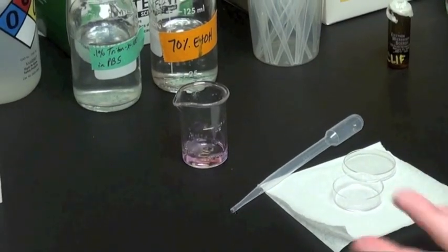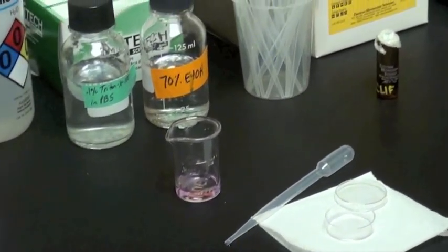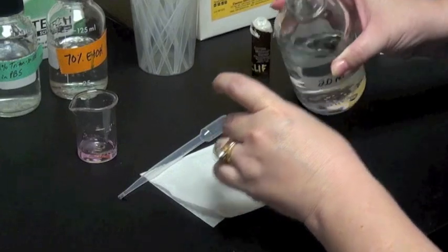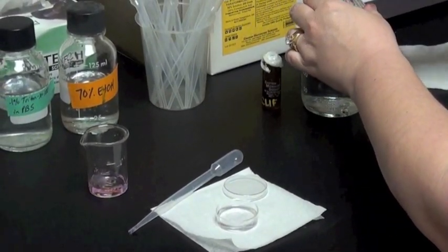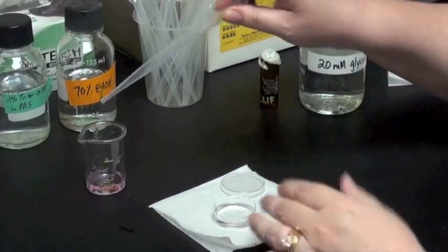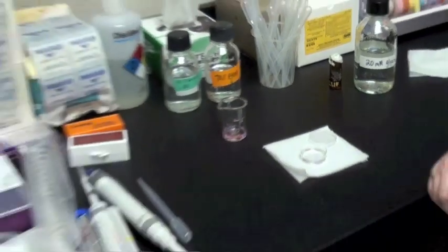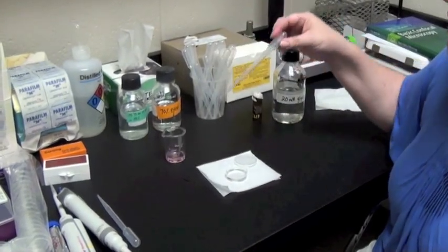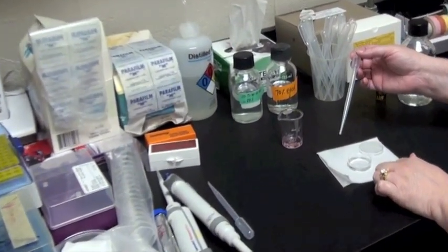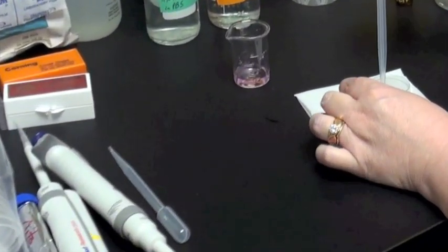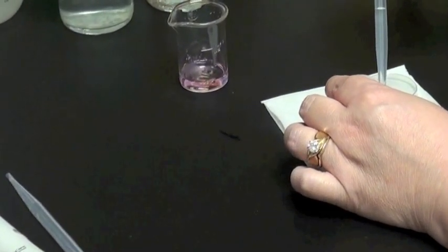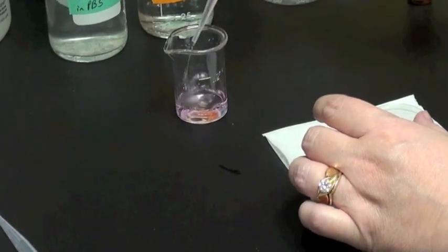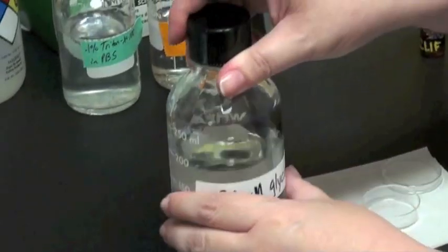We'll wash twice in the 20 millimolar glycine solution, and then we'll add 20 millimolar glycine and block our sample for 20 minutes at room temperature. This will ensure that all of my free aldehyde groups from my fixation have been compensated for and I don't get extra autofluorescence in my sample.